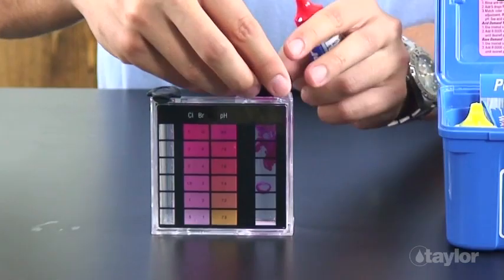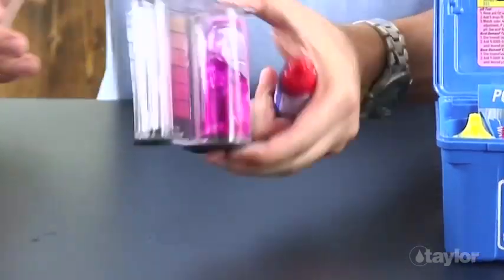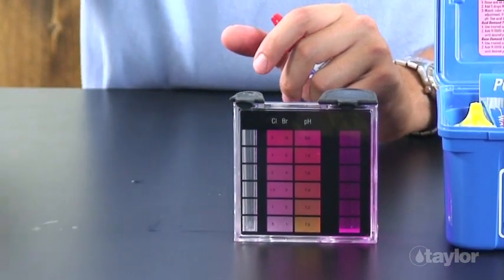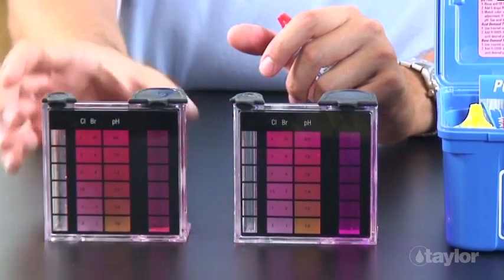The phenol red will react with high chlorine or bromine to create a hue not seen on the color standards, usually bluish purple. Generally, this happens around 10 parts per million of chlorine or 20 parts per million of bromine.